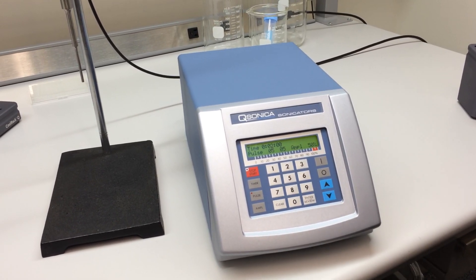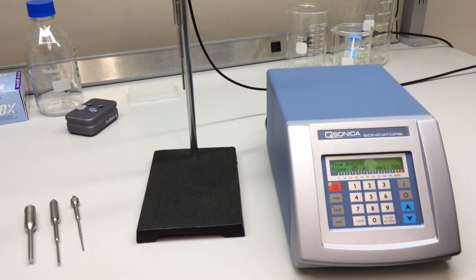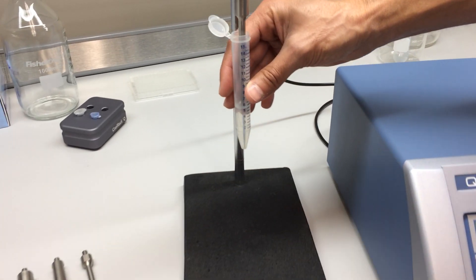Sonication generates heat, so when using an ultrasonic device, most users sonicate their sample on ice to help control temperature. In addition to ice, the pulse mode is used to help prevent overheating of your sample.